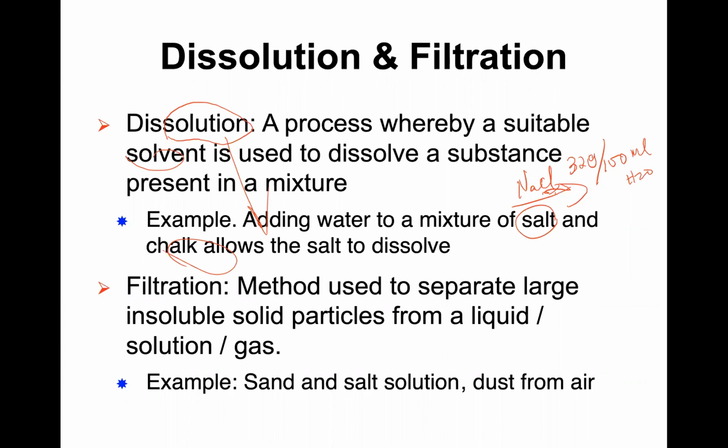Combined with the dissolution, we will see the filtration. Filtration is basically done with a filter, right? So that means it's used to separate large insoluble solid particles from a liquid, or from a solution, or from a gas mixture. In this case, we have to watch out for the note.